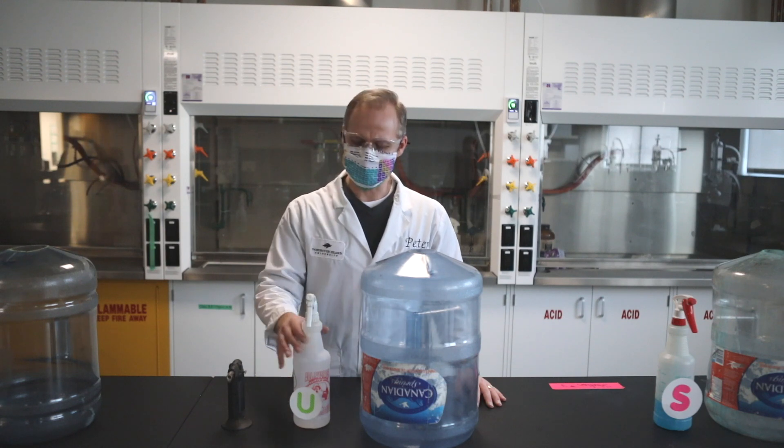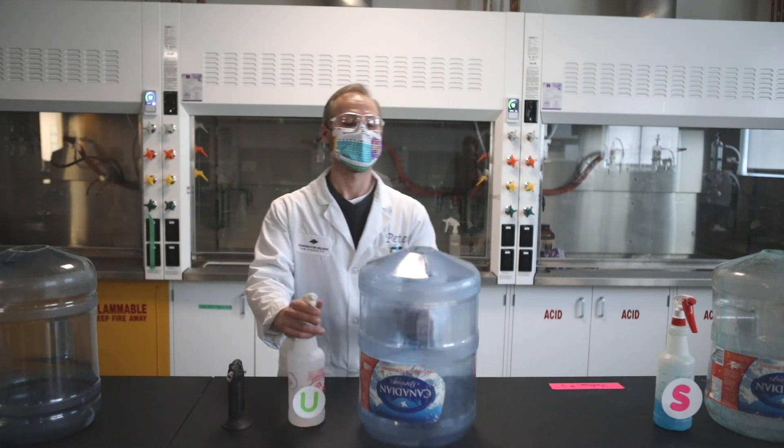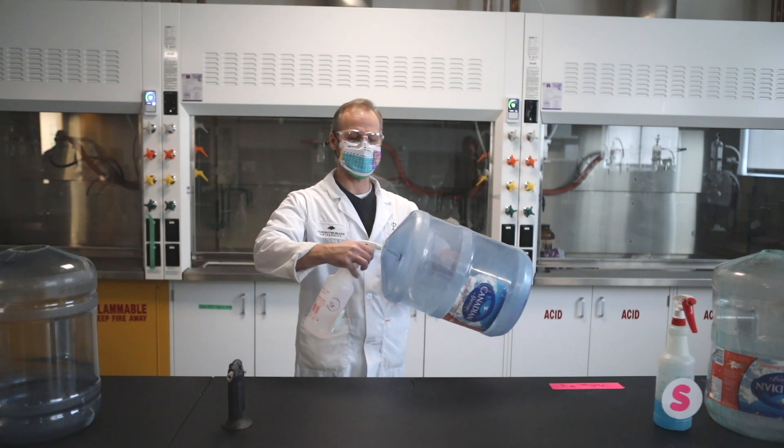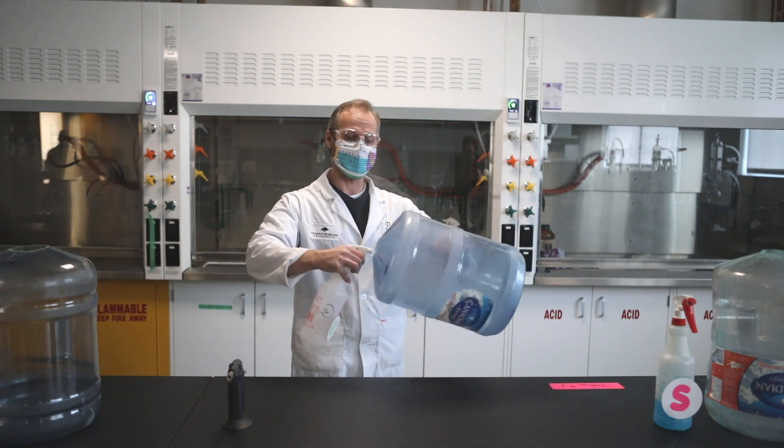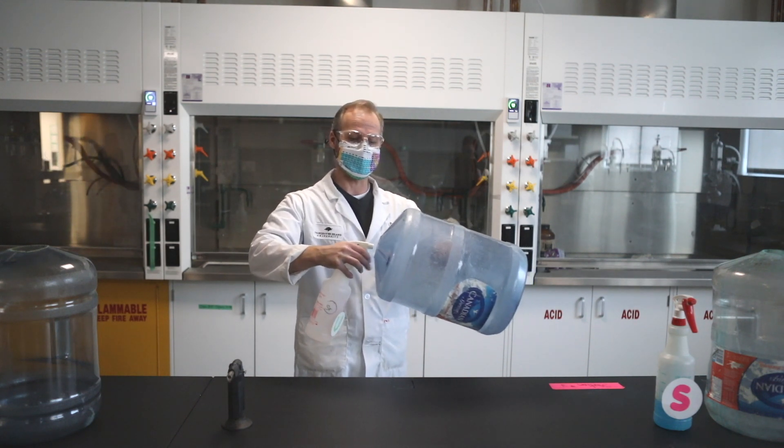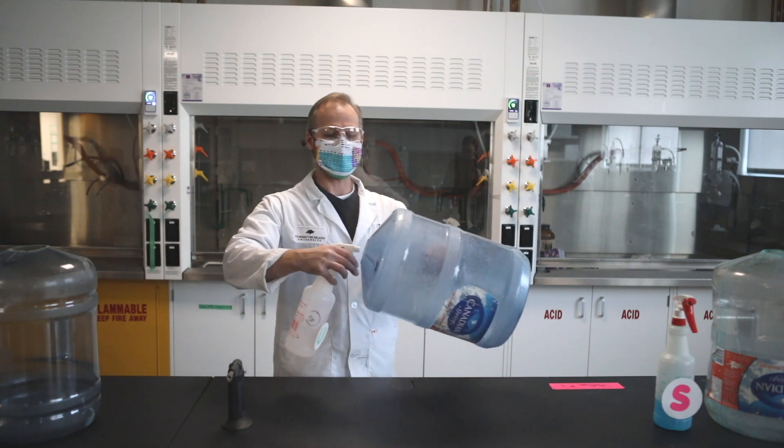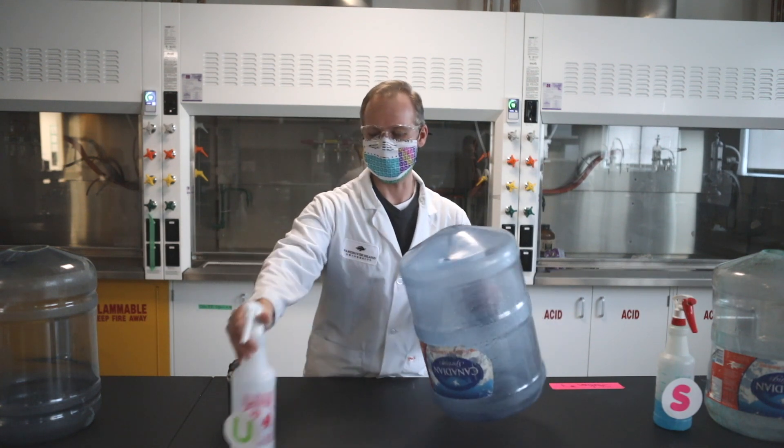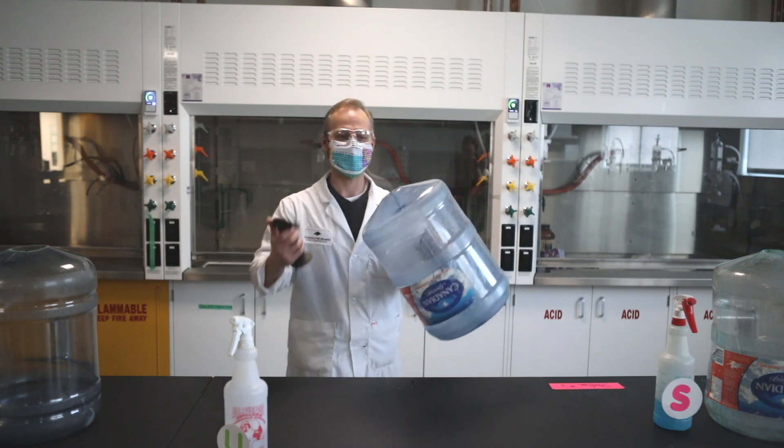Alright, so for the next one, we've got this colorless solution, but it's strontium. So we're going to put some strontium inside this jug, again using the ethanol as a way to sort of deliver it and to ignite it. And we're going to see what color it gives when it burns. That should be enough. Alright, let's see what happens.